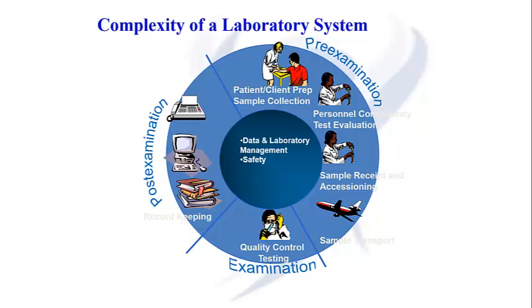There are many procedures and processes that are performed in the laboratory, and each of these must be carried out correctly in order to assure accuracy and reliability of testing. An error in any part of the cycle can produce a poor laboratory result. A method of detecting errors at each phase of testing is needed if quality is to be assured.